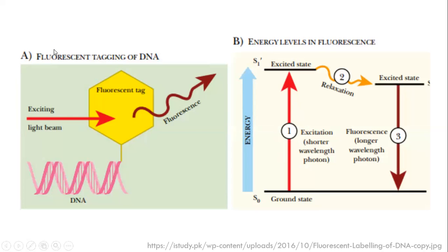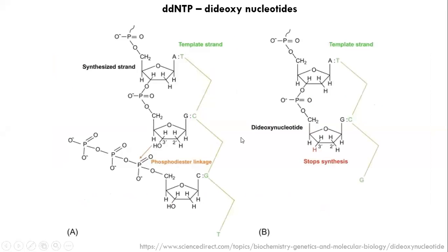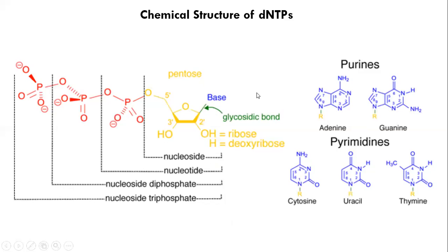So again, one more process you need to understand. Deoxyribonucleotides can be attached to a fluorescent tag. So for example, the fluorescent tag usually comes along in this structure. The base comes here. The tag can be attached to one of these. You make a redox reaction, you make a reduction. One of the bonds will be exposed in pyrimidines, purines. You attach a specific fluorescent tag to that. Then the tag may be green, red, or whatever based on the fluorescence molecule or probe available.